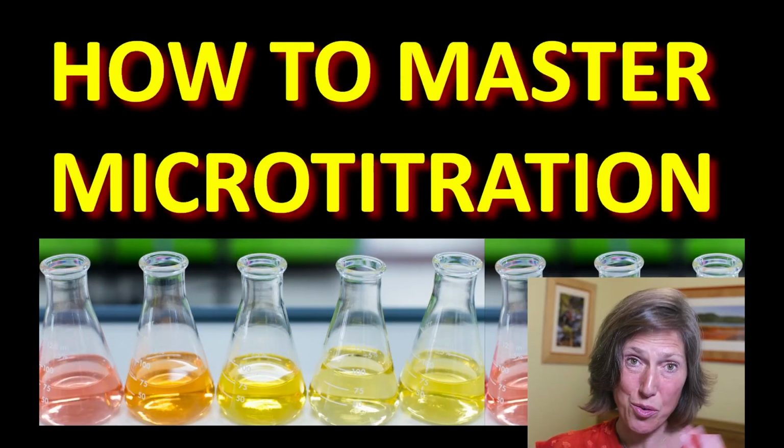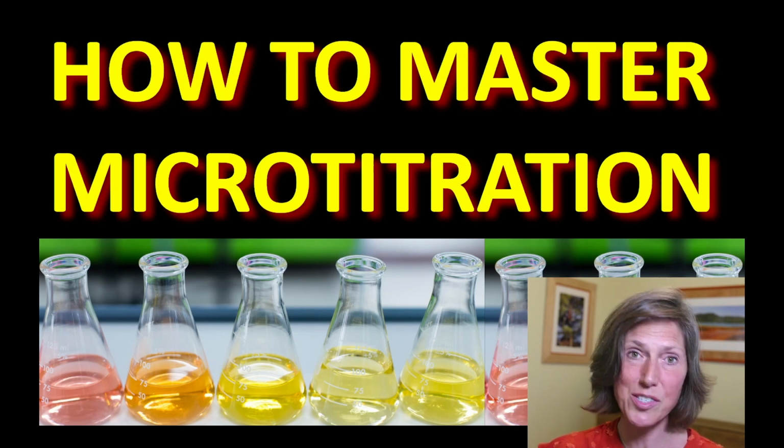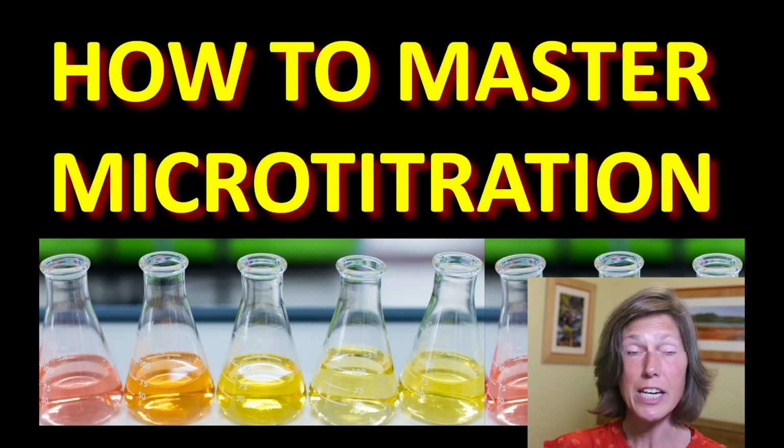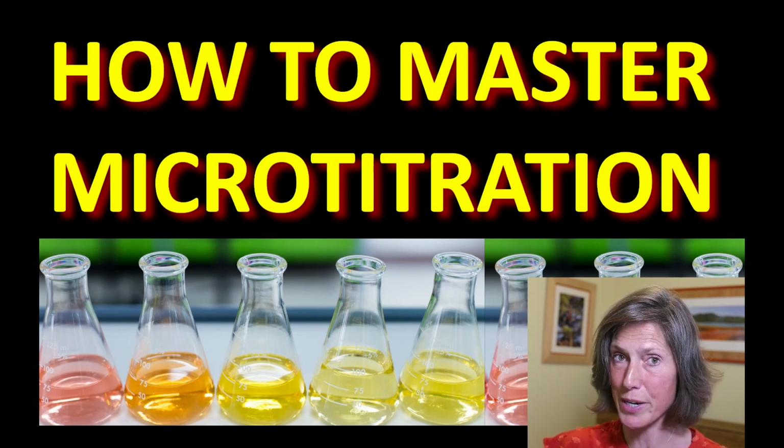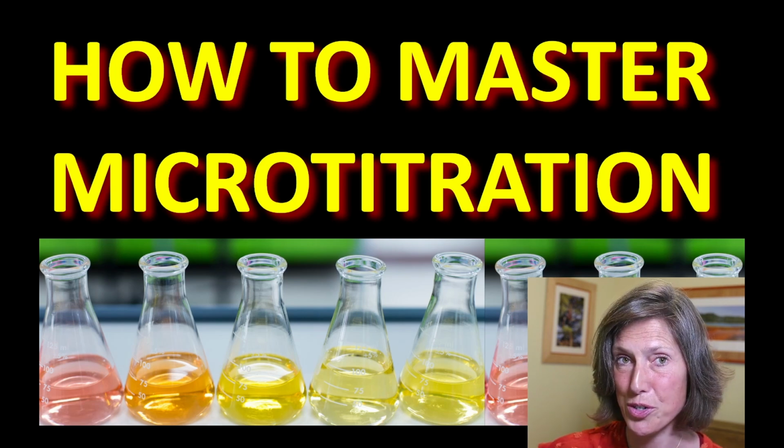So I hope that this third video in the sequence of understanding acids and bases in terms of basic characteristics, in terms of molarity, and then figuring out unknown concentrations by doing a titration, in essence a neutralization reaction, will be helpful to your students.